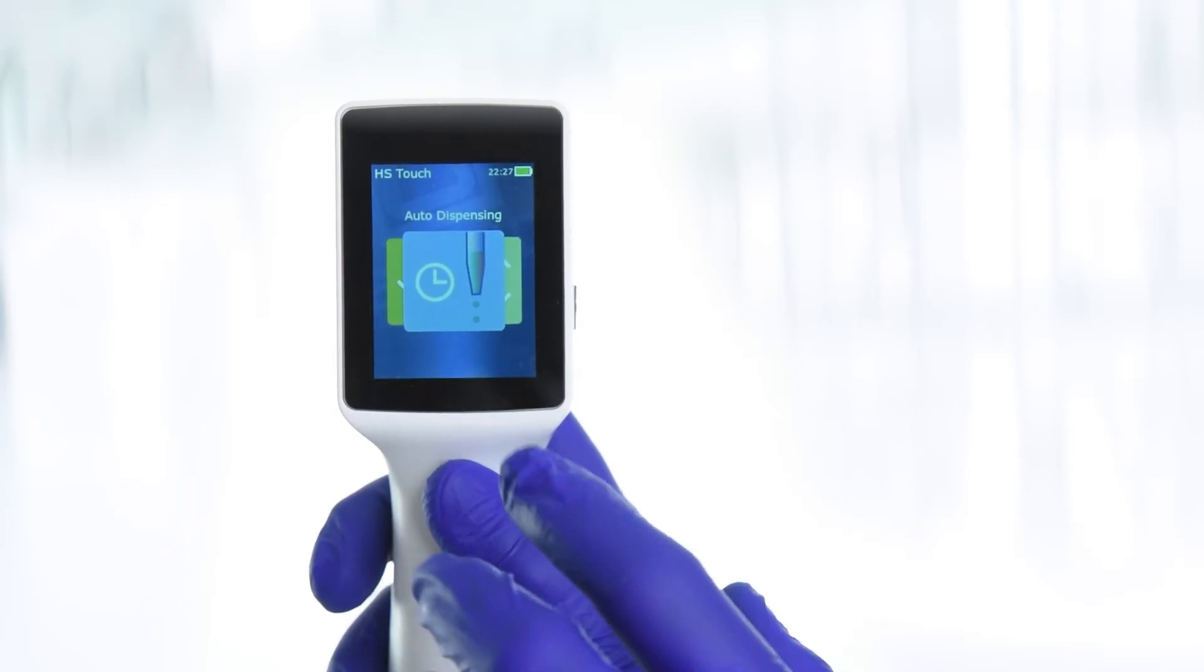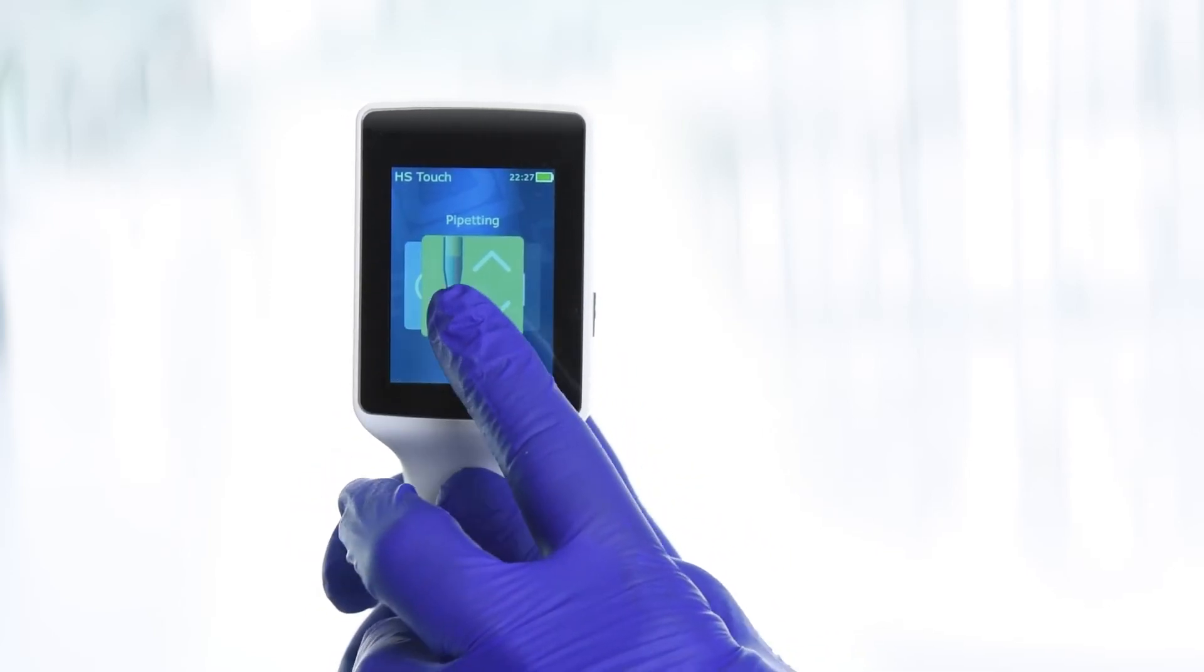Swipe left or right until the Pipetting Mode is displayed. Then tap to confirm.